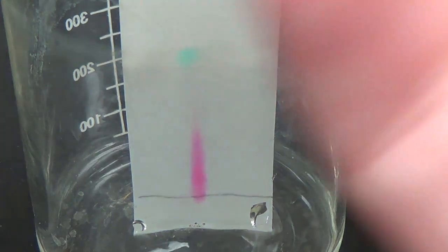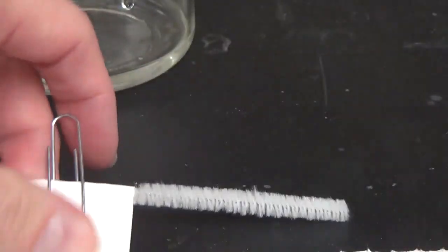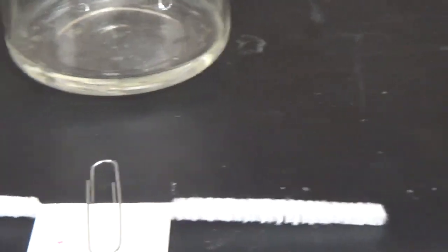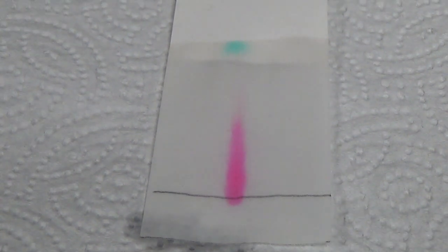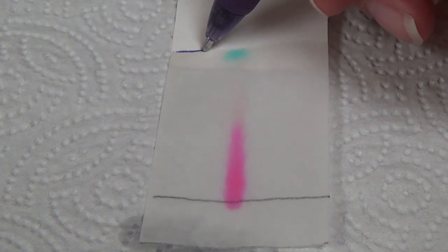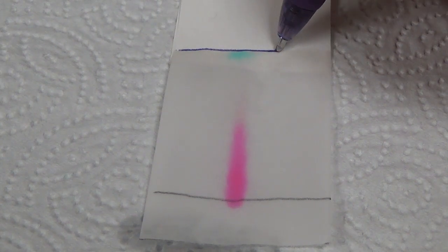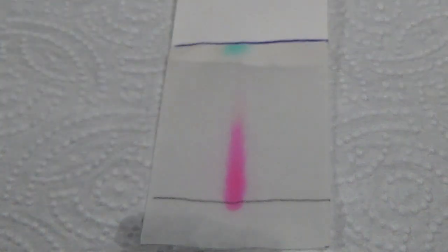We're going to get a piece of paper towel. And on our paper towel, we're going to place our wet chromatography paper. And I need to trace how far the water line got. So I'm going to, and I can use pen this time, trace how far the water line got just by literally tracing the water line. You can use pencil too, doesn't matter.